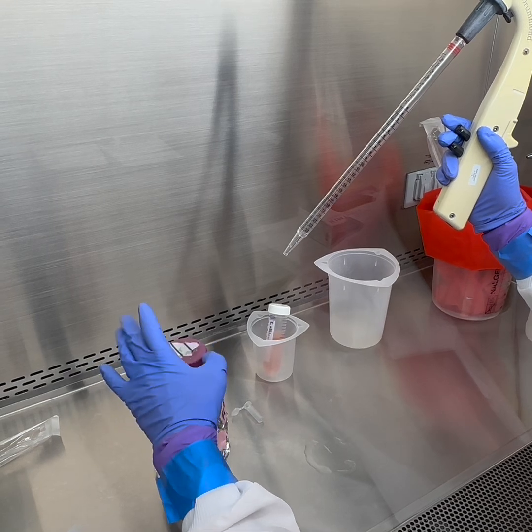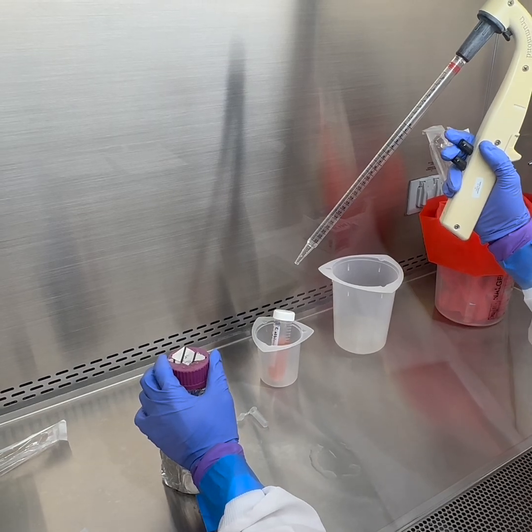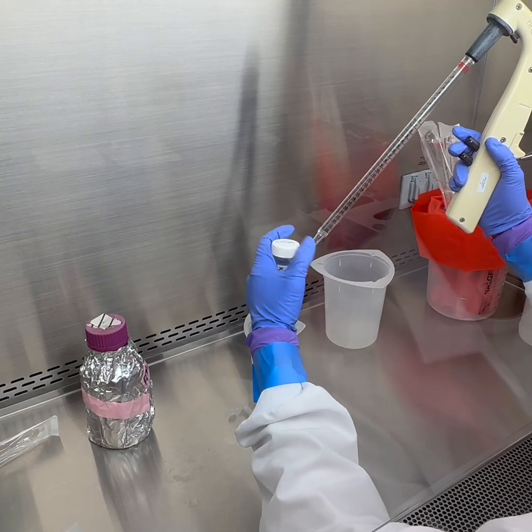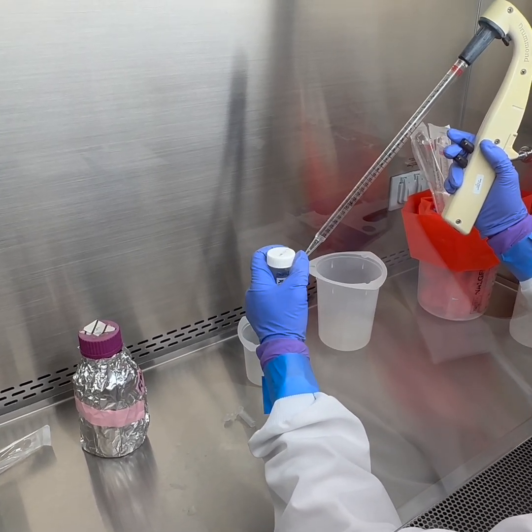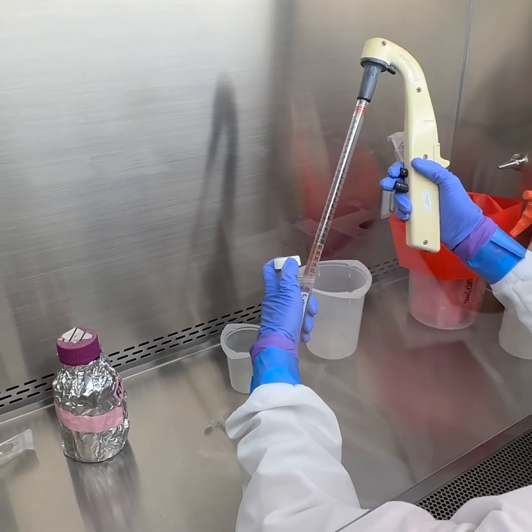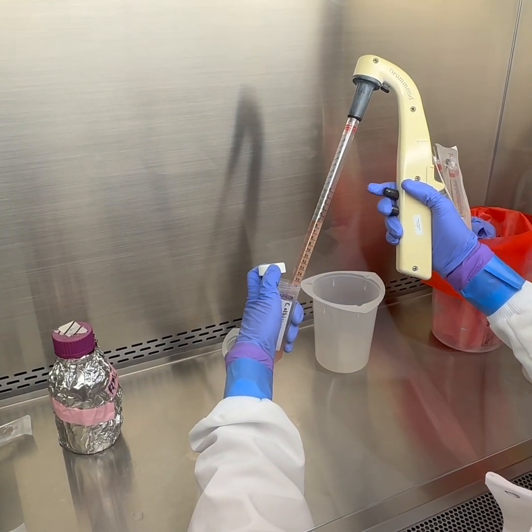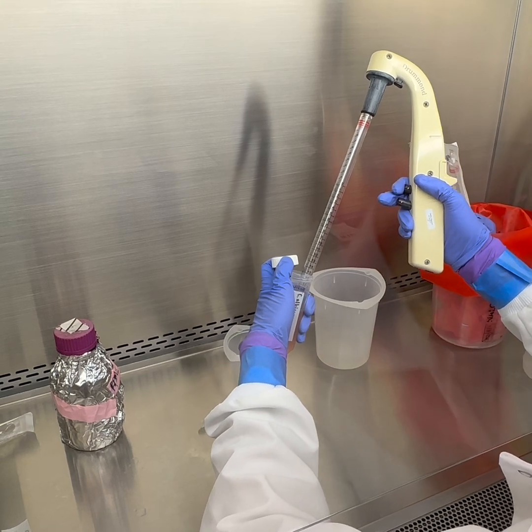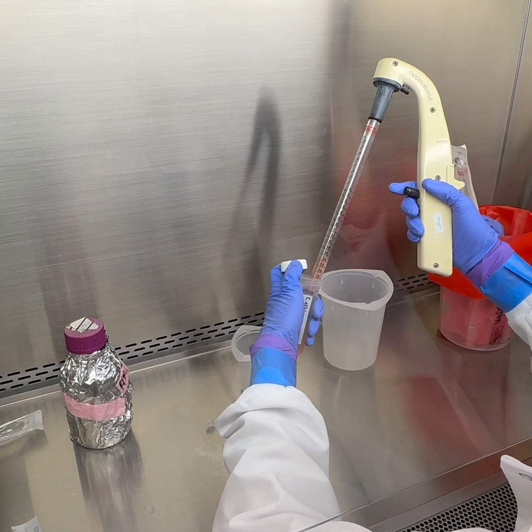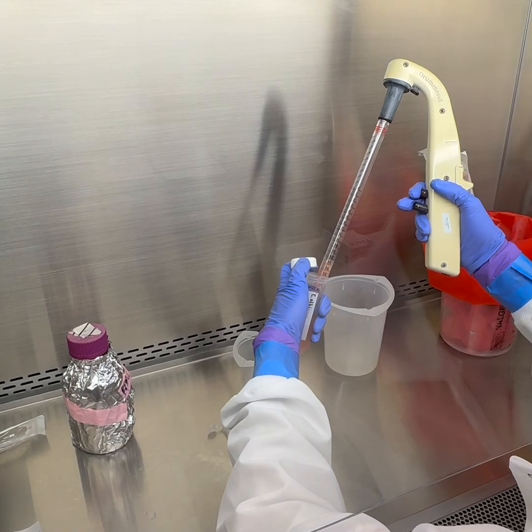Reseal this. You'll see I have an Eppendorf in here for making a small aliquot. This is for our cell counting. So we'll enumerate via hemocytometer microscopy, which is just a fancy word for counting cells in a grid with the microscope. So I'm going to make sure this is homogeneous so that I can get an accurate cell count. This is one of the most critical steps to make sure that it's homogeneous.